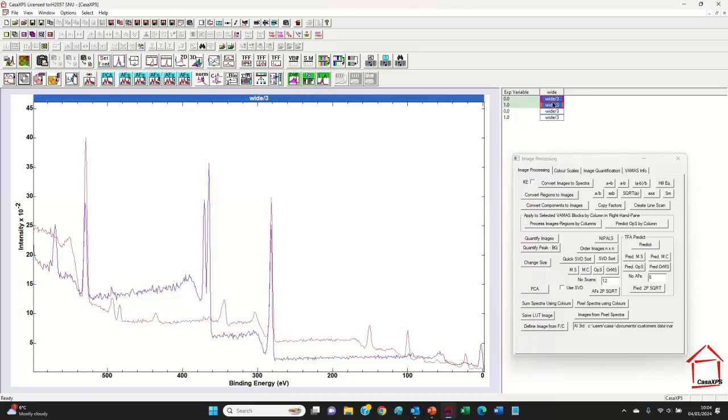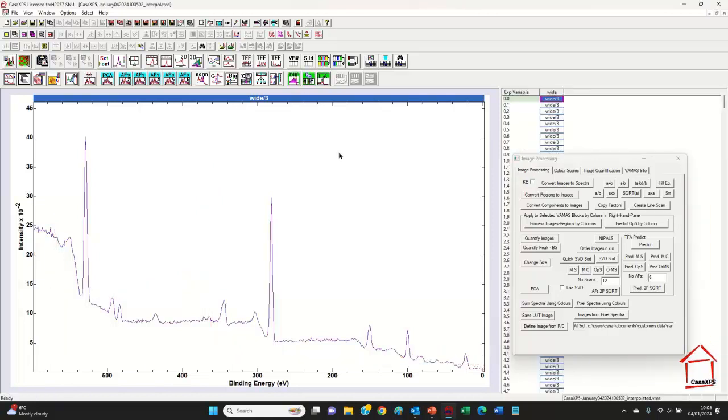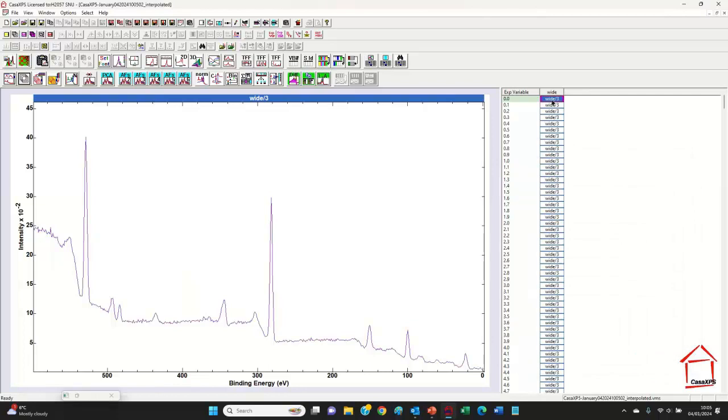spectrum. So I've taken these two, I've overlaid these in the active tile in the order that I wish to perform the subtraction. So I want to produce a glass spectrum that has no silver, so I've selected the glass first and the silver second, then performed a difference calculation which has the result of producing a set of spectra that progressively remove from the one spectrum a proportion of the other. I've now removed the silver.